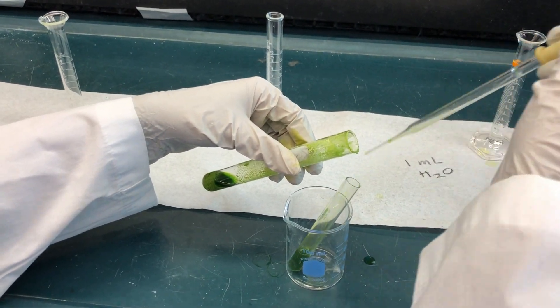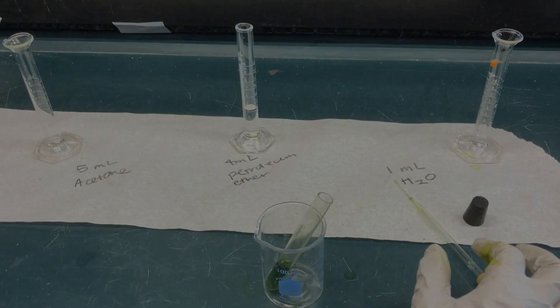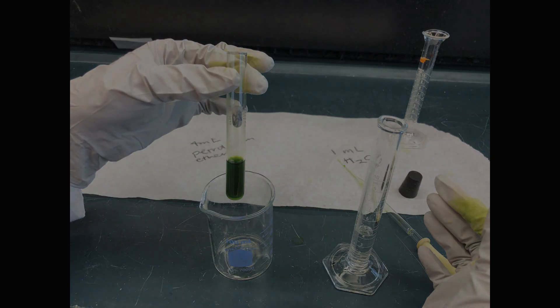Use a pipette to transfer as much of the liquid as possible into a clean, small test tube. The pigments will be in the acetone.